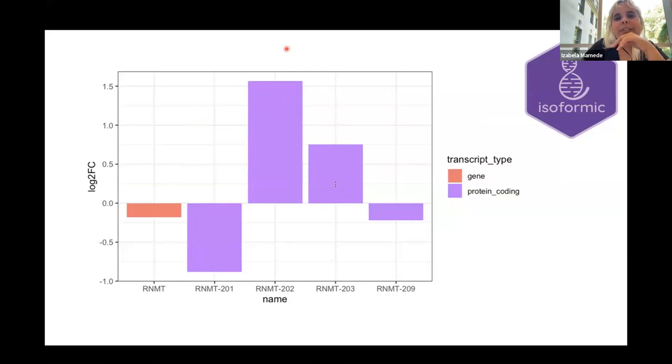This is a good question. Joy asked, is it fair to say transcript is a synonym for isoform? That is a thing that I asked myself, because isoform is normally a nomenclature that people from the protein side use. Like they do different protein isoforms and different protein biotypes. I kind of prefer the different expressed transcripts, because it's related more with the fact that they are transcribed. They are the recently transcribed. But you can also say isoforms.